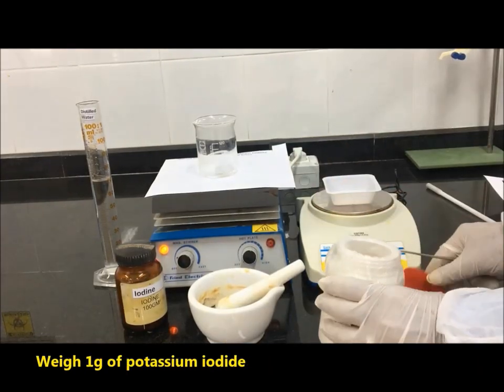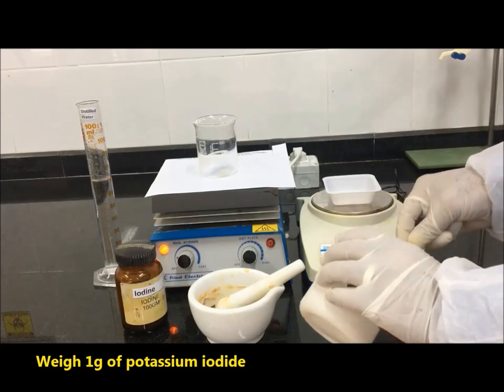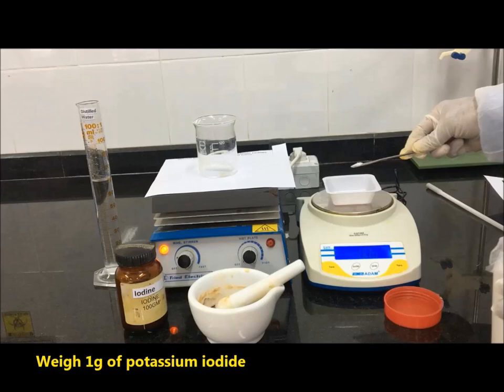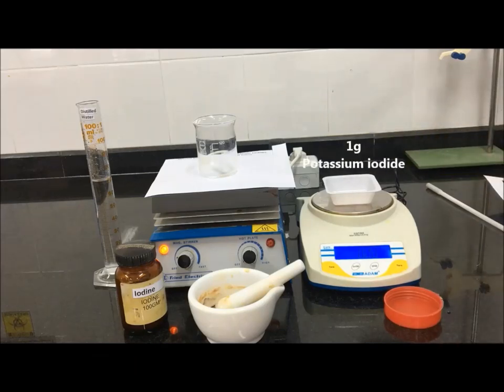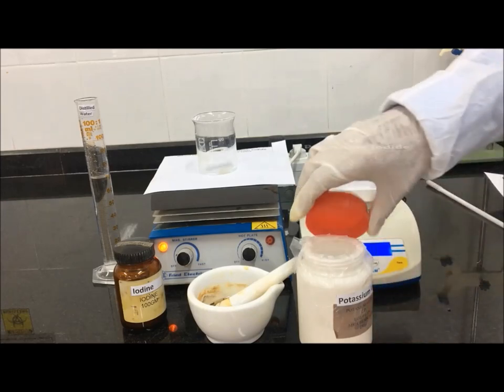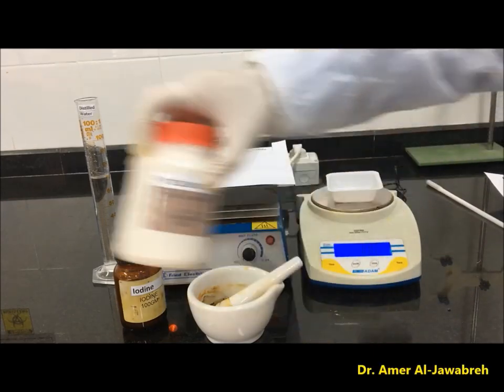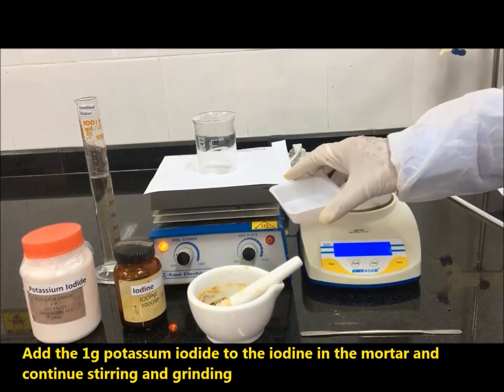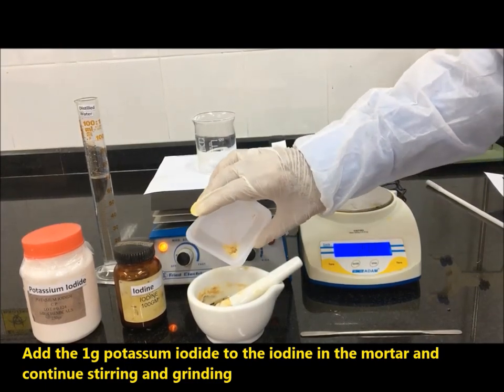Weigh 1 gram of potassium iodide. Add the 1 gram of potassium iodide to the iodine in the mortar and continue stirring and grinding.